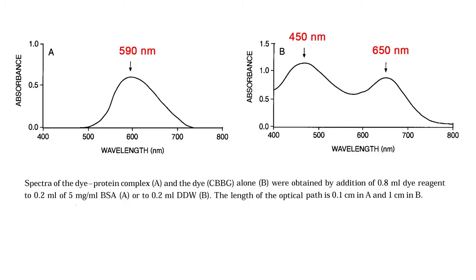In the original old Bradford method, absorbances of standard protein solutions are measured at 590 nanometers, and the protein standard curve thus obtained is not linear, causing an incorrect protein measurement of the sample.